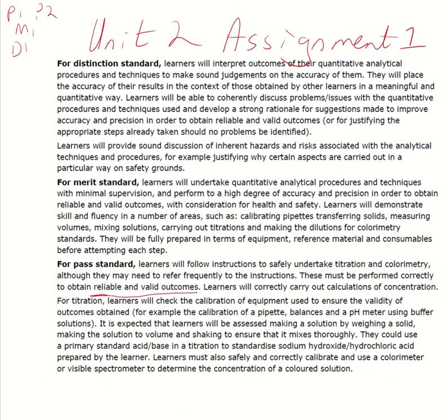So P1 is this bit in here. As P1 on your brief says, prepare and standardize solutions for titration and colorimetry.